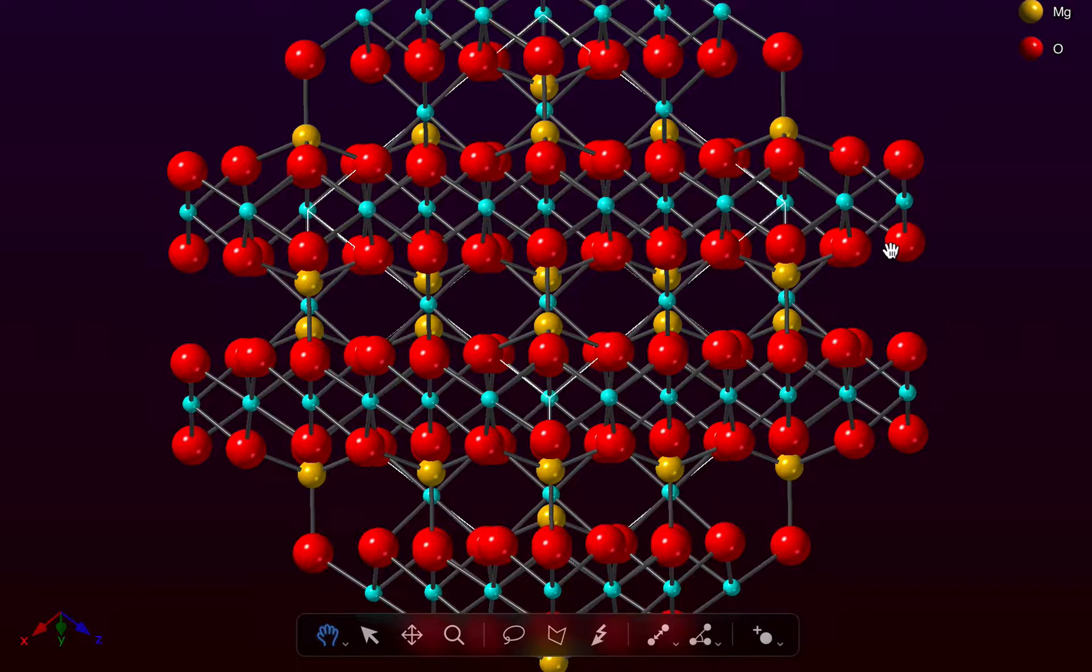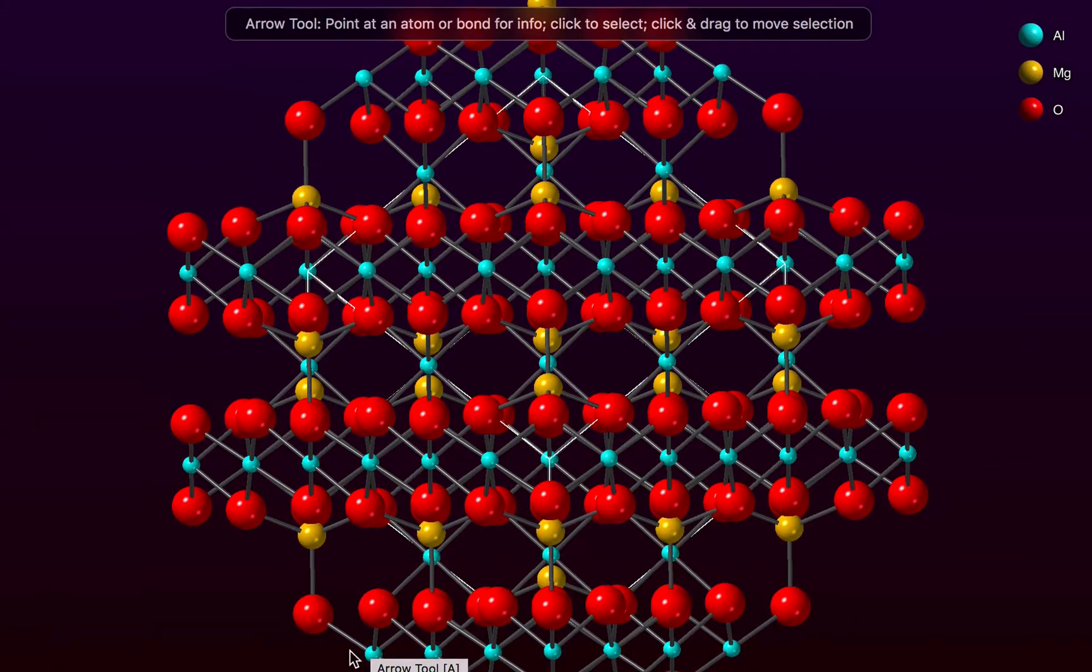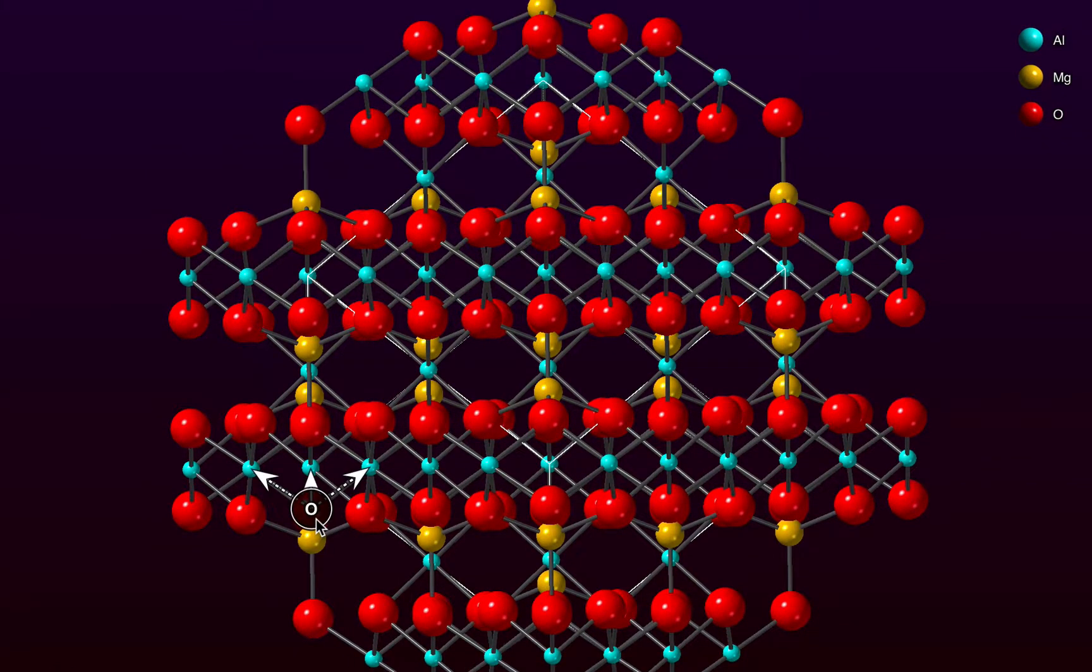So the first thing I'm going to do is move down to the tool strip at the bottom of the window and choose the arrow tool. This is a very versatile tool. You can use this as a rollover tool to measure and identify atoms or groups of atoms in your structure, but it also functions as a selection tool.